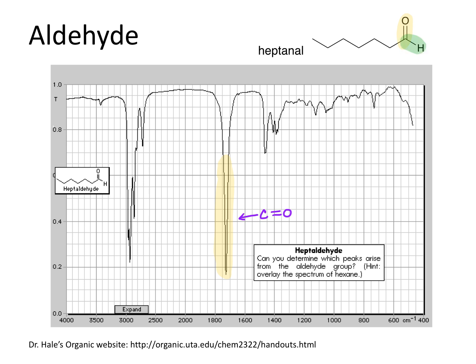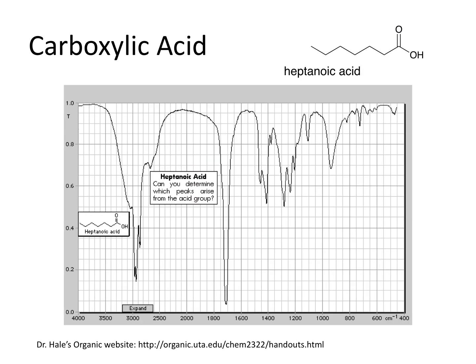Because that hydrogen's next to a double bond, but it's an O, it's a little bit similar to the double bond C, but it's on the other side. So if you look, it'll say this on the chart, but aldehydes have a carbonyl plus the CH peak. The CH peak is this little peak right here, on the right of the big peak that we're ignoring, the middle one. So label it like this. Key peaks would be number 1, carbonyl. Number 2, the special CH peak labeled there. Okay? All right, let's keep going.